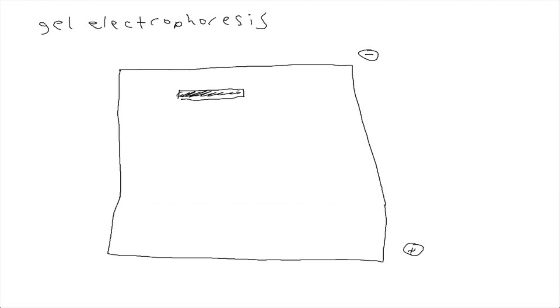And then you stain it so you can see how far they traveled. How far the sample is moved in the gel.